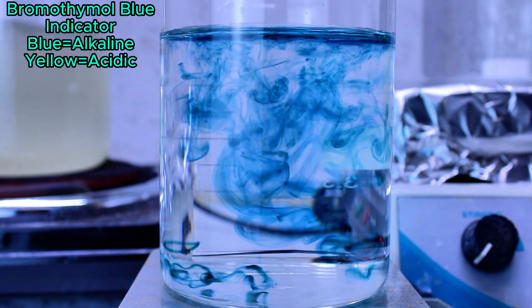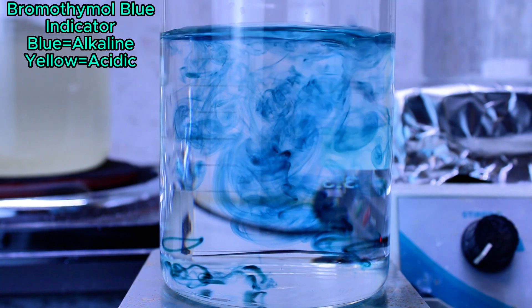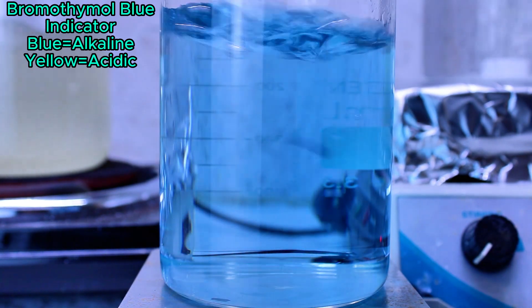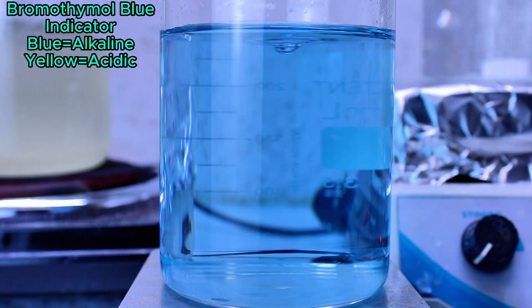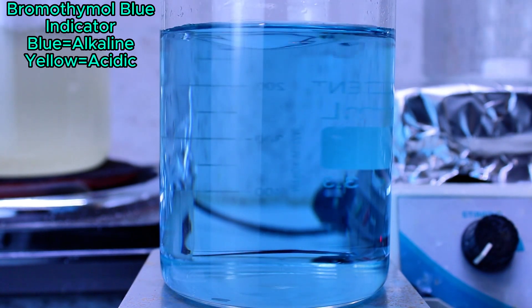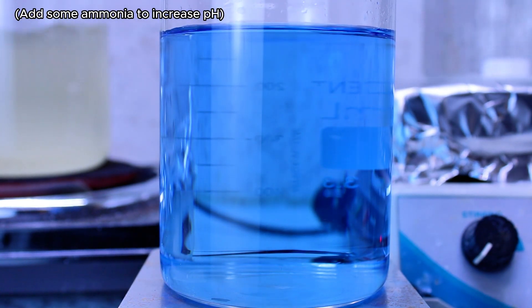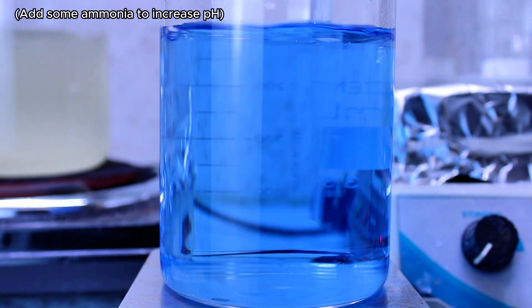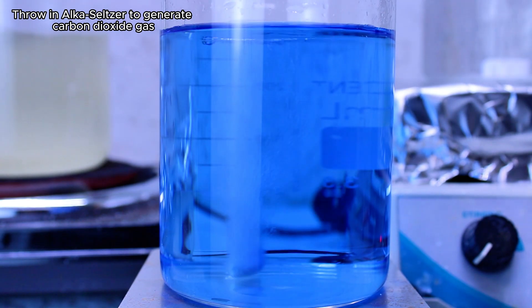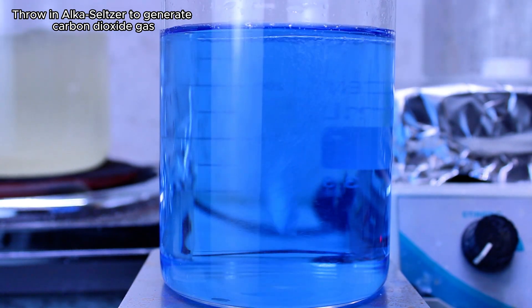Bromothymol blue is an acid base indicator that becomes blue at high pHs indicating an alkaline environment, and it becomes green and then yellow at lower and lower pHs. I also add a bit of ammonia so that the reaction is more vibrant, and then I throw an Alka-Seltzer in the water which immediately begins to bubble as it releases carbon dioxide gas into the solution.